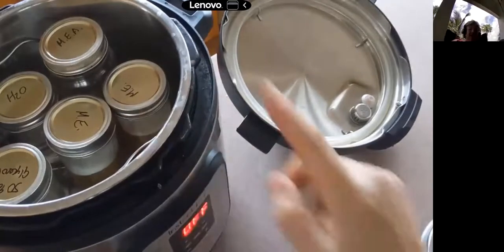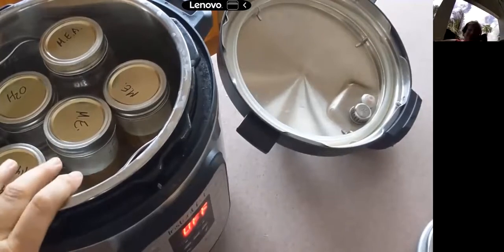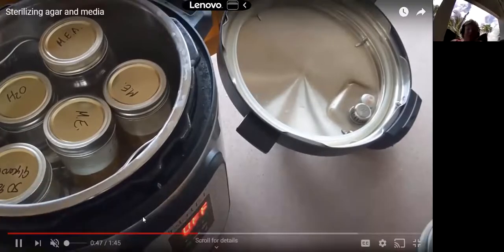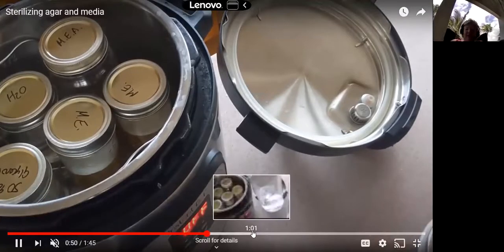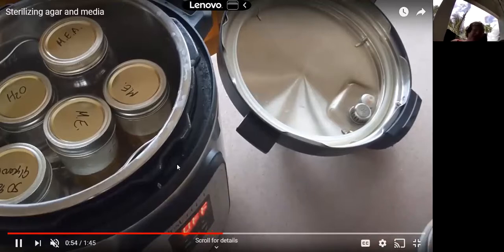You need to add water in the bottom underneath your trivet. If you do not have water, you are not going to generate steam. If you don't generate steam, you're not going to generate the temperatures and pressures necessary to sterilize your cans. Once you've got everything ready to go, see here, I'm finally adding the water here. Apparently I was talking a lot.